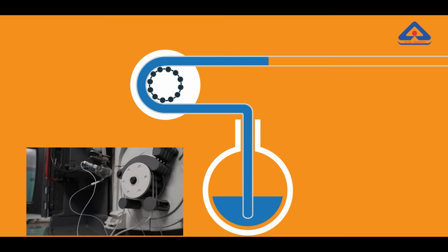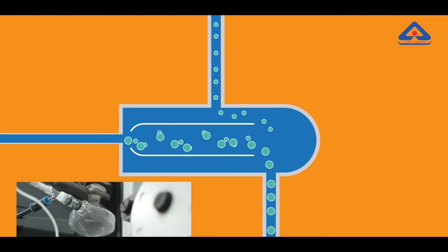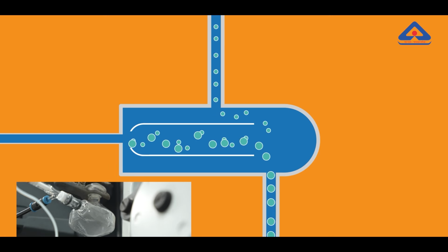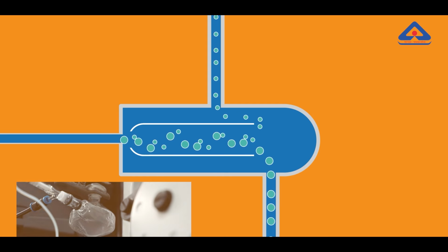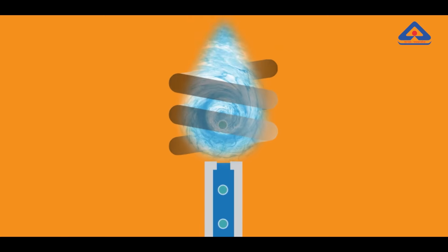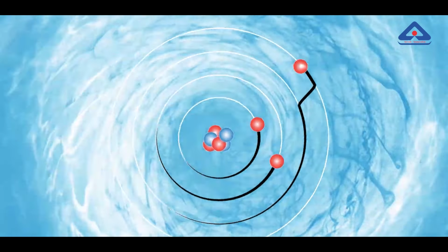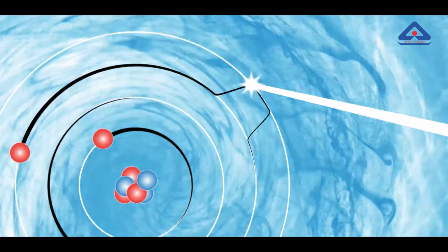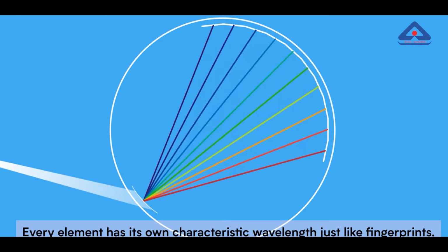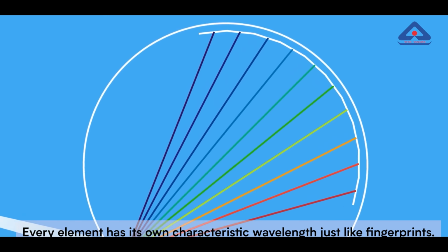The liquid sample is drawn into the peristaltic pump. In the nebulizer, it's converted into a fine aerosol spray. In the spray chamber, larger droplets drain away, but finer droplets are directed into the hot plasma. In the plasma, the sample aerosol vaporizes at 10,000 K, and its atoms and ions are excited so that characteristic wavelengths are emitted. The light is transferred into the high-resolution, no-purge sealed optical system, which separates the light into the specific wavelengths for the elements to be measured.